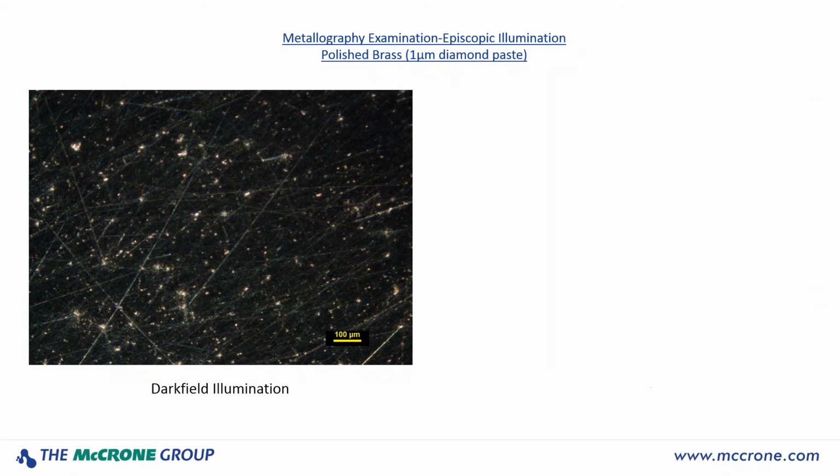If we take a look at it with dark field illumination, now we don't see the scratches quite as much, but it's really highlighting all the little inclusions that are on the surface or within the surface of that metal. And now you can take something like this image and take it offline into an image processing software and do a particle sizing. You can do a particle distribution, particle frequency. You can do particles per unit area, things like that, to help characterize the sample.